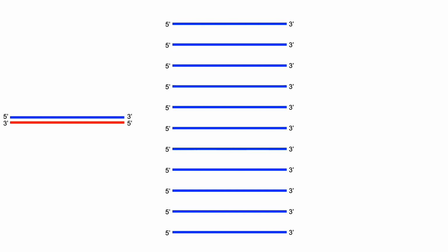And in the cycles in Sanger sequencing, we're only getting linear growth. It's not exponential. So we need a lot of template around in order to actually get good results from the sequencing. So we will have our primers come, and they're all going to anneal in the same spot.